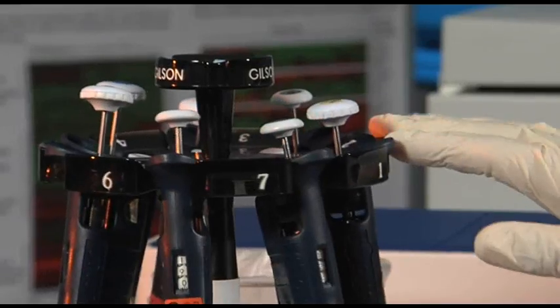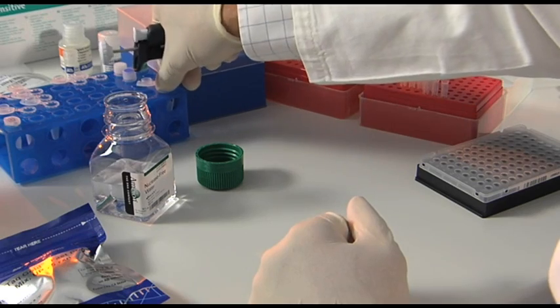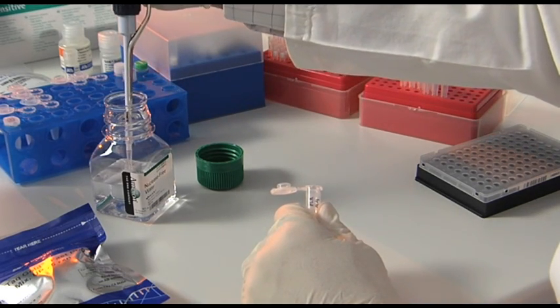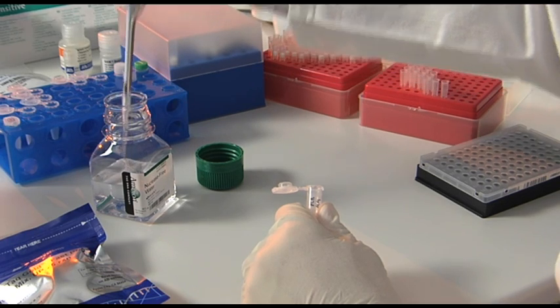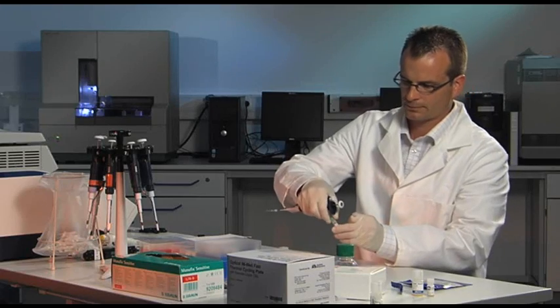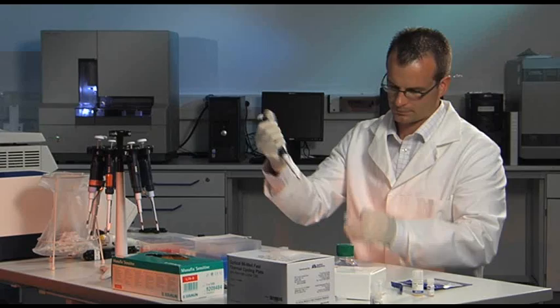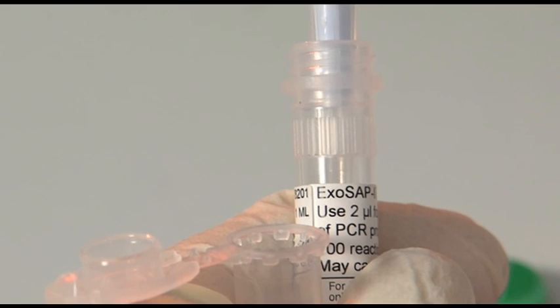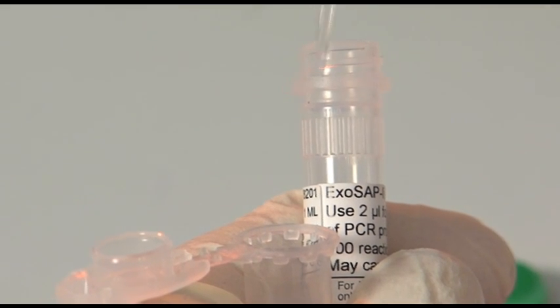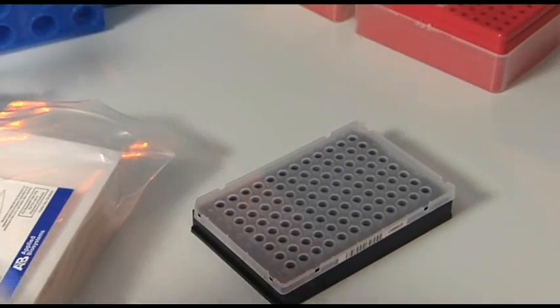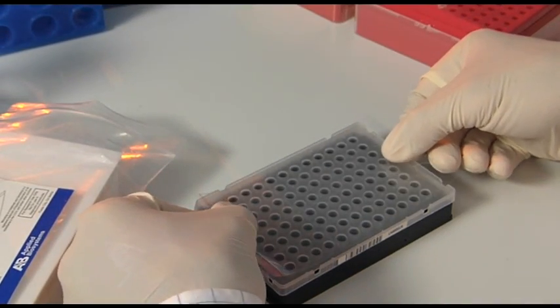The next step in Applied Biosystems fast resequencing workflow depends on the application. If you are looking for mutations, an enzymatic purification of the PCR products is recommended. The enzymatic purification can be carried out in the same plate used for amplification. Simply pipette the enzyme cocktail into the samples and incubate approximately 30 minutes in the Verity Fast Thermal Cycler.